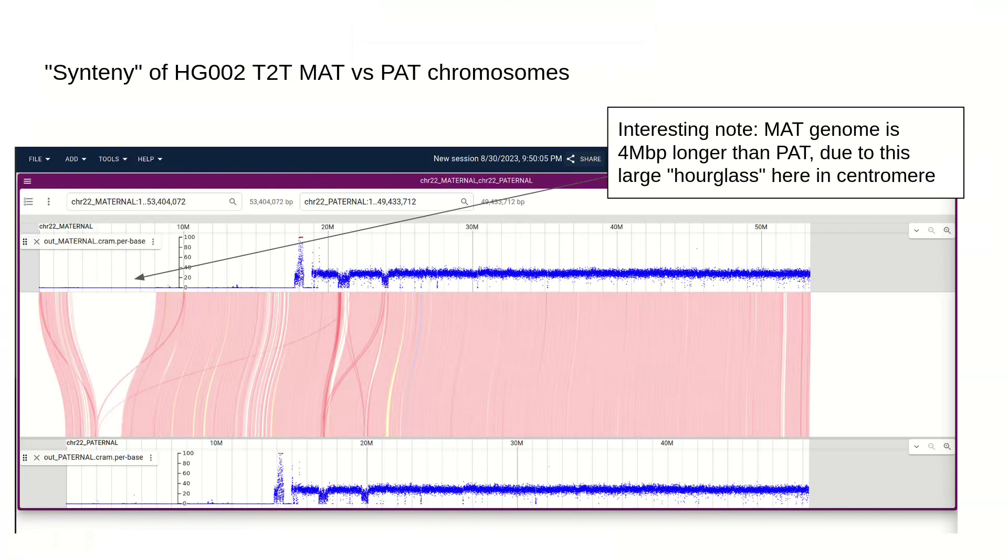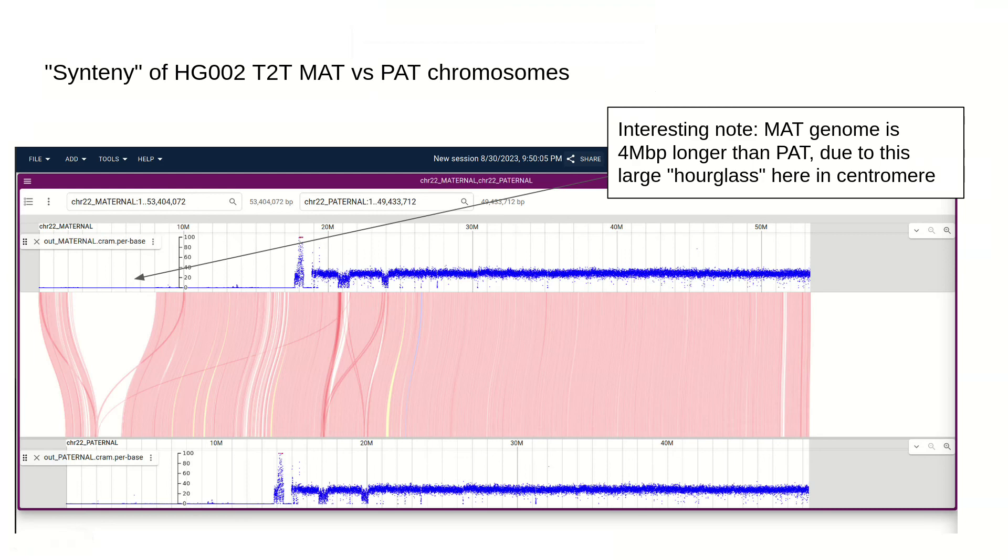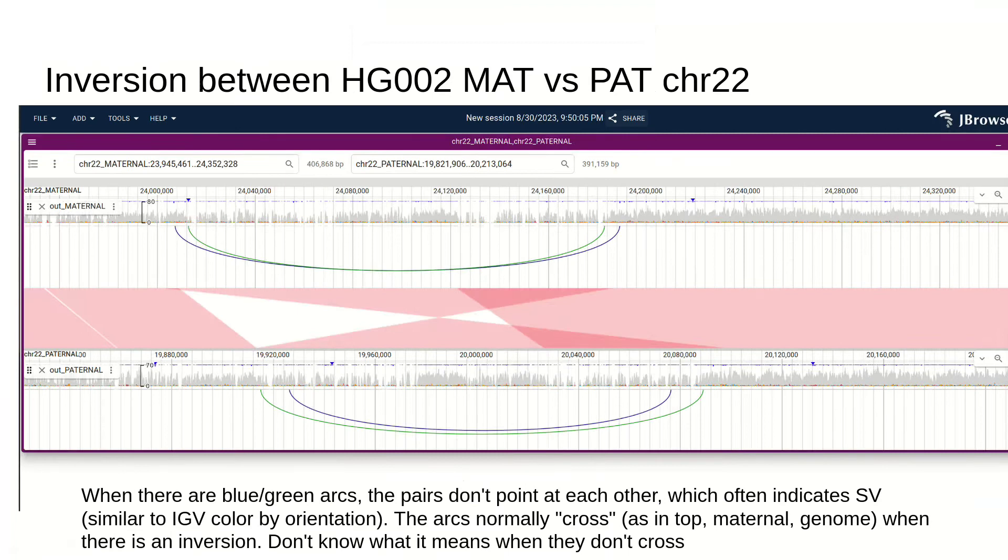This is continuing in the maternal versus paternal investigation. There's a large inversion between these two genomes, the maternal on top and the paternal on the bottom. And again, this blue and green paired-end read pattern gives us evidence for the inversion.